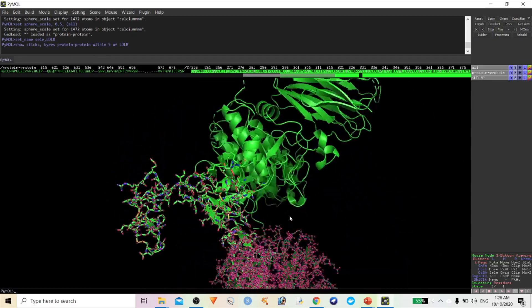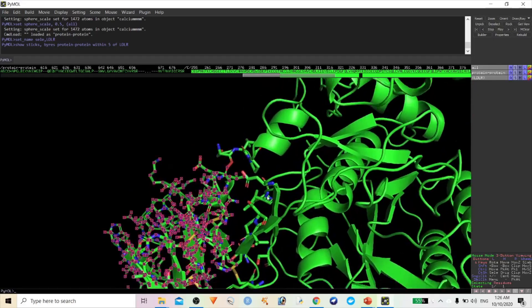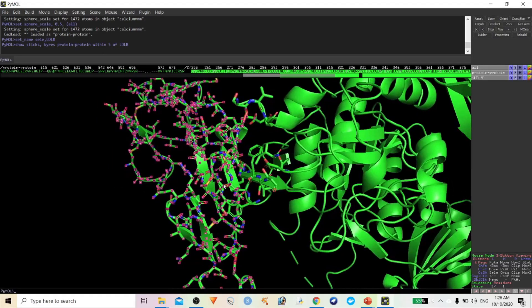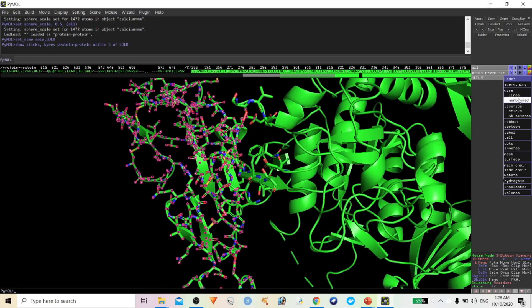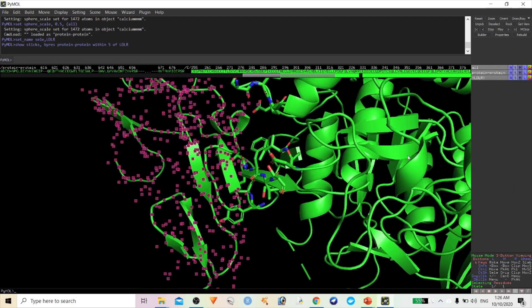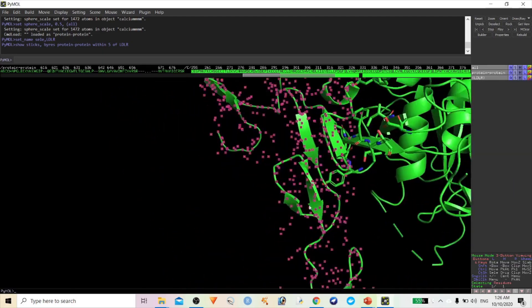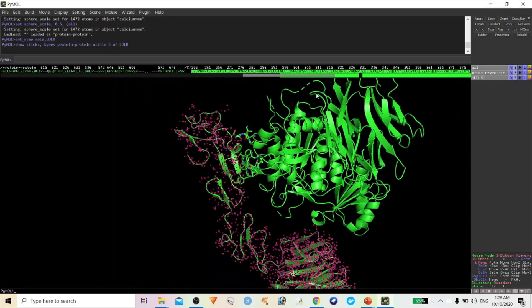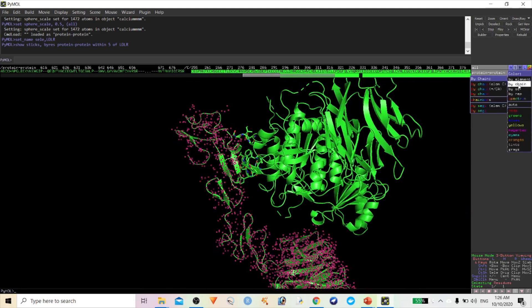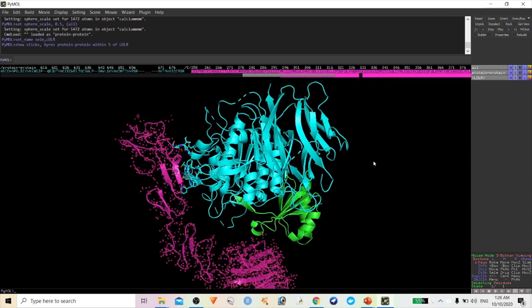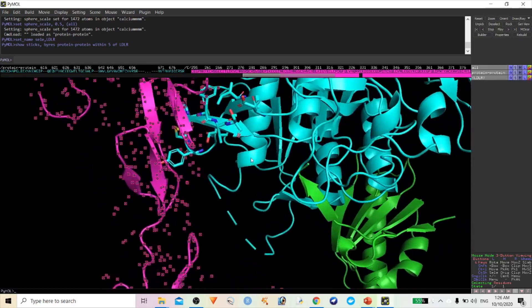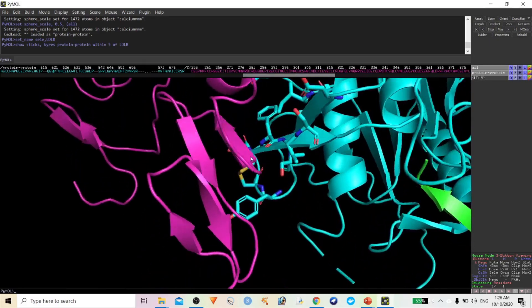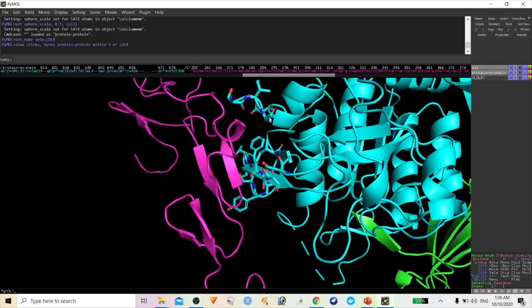Click on Hide Sticks, then show only the sticks of PCSK9. Change the colors by chain so you can differentiate them. You can see the amino acids which are 5 angstrom distance away from the LDLR receptor.